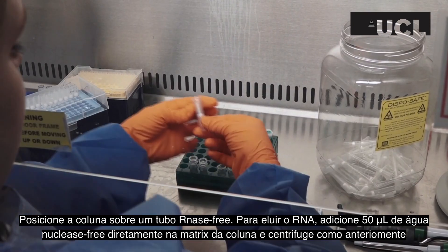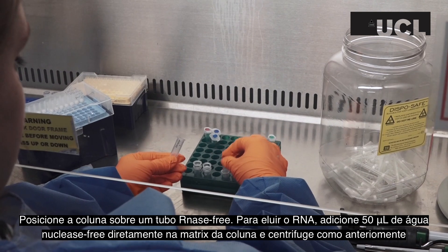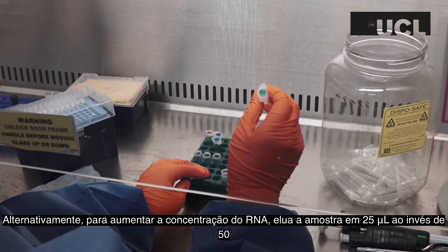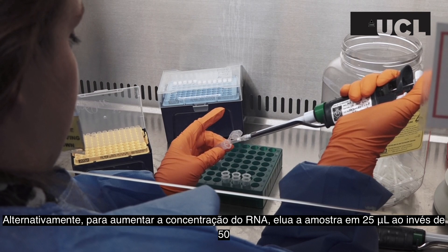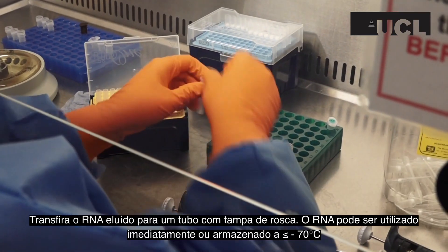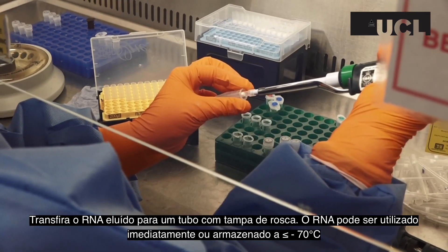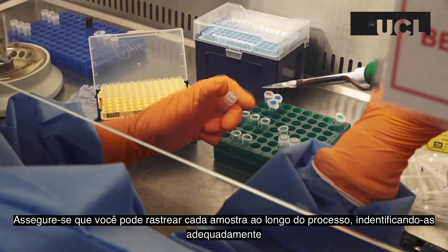Transfer the column carefully to an RNase-free tube. To elute your RNA, add 50 µl of DNase and RNase-free water directly to the column matrix and centrifuge as described before. Alternatively, for a higher concentrated RNA, elute into 25 µl instead of 50. Transfer the eluted RNA into a screw cap tube. The eluted RNA can be used immediately or stored at minus 70 degrees. Ensure that you keep track of each of your samples throughout this process by labelling them clearly.